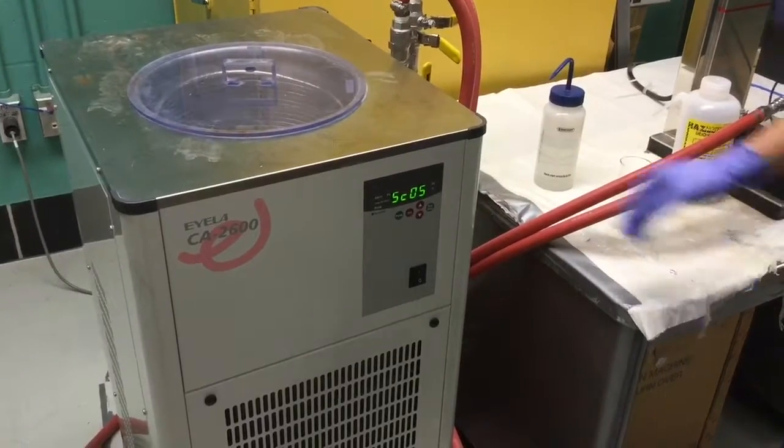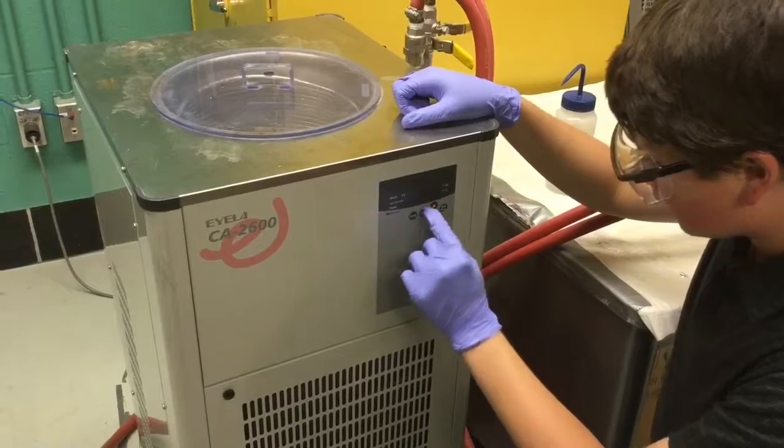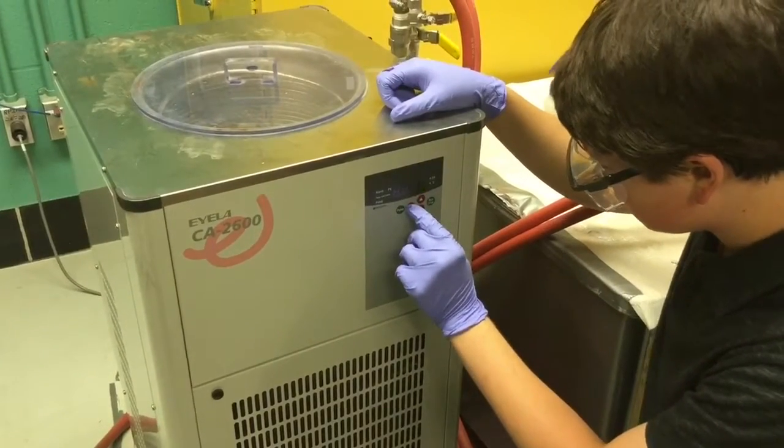Use the on-off switch to turn on the water cooler. Press set and then use the up and down arrows to adjust the temperature of the water. Press set again, and then press pump to begin pumping the water.